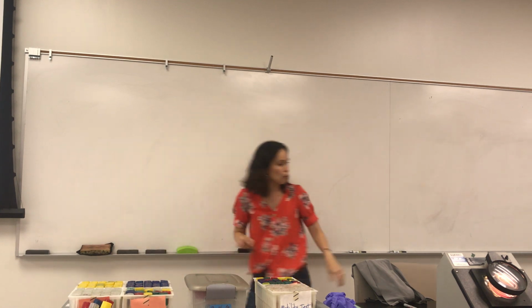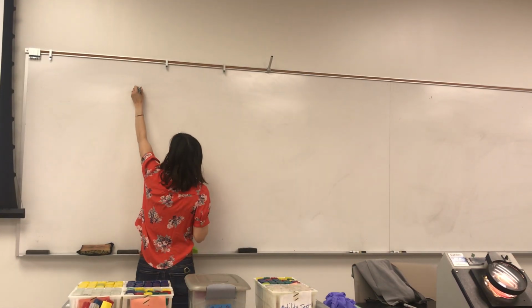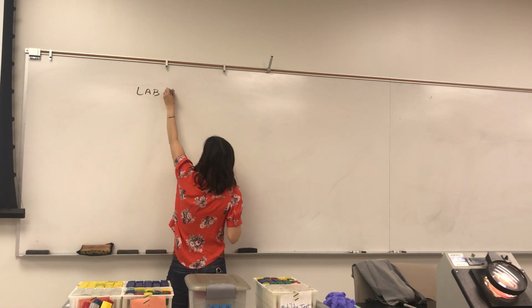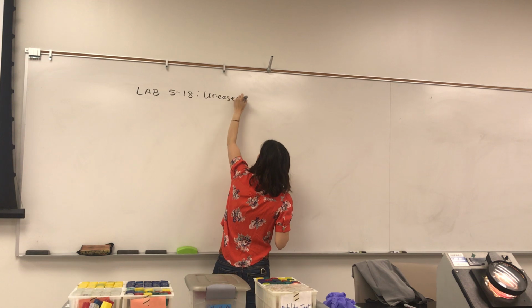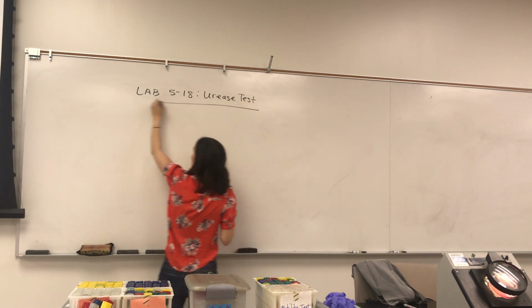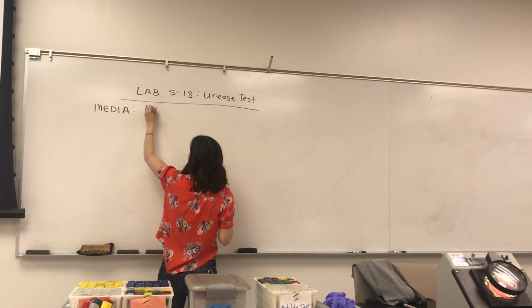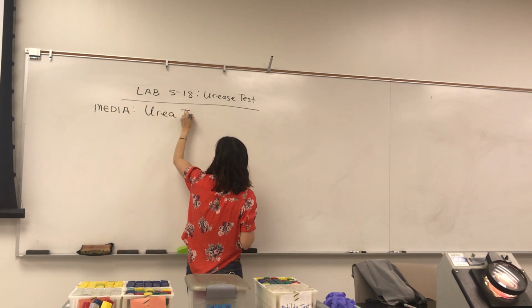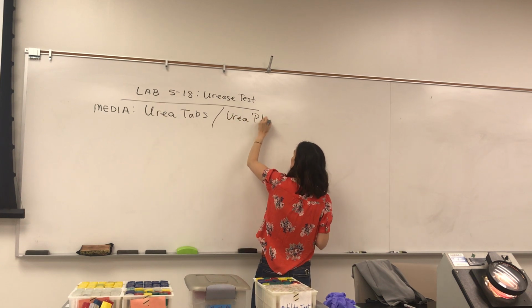All right. So for this lab, there's actually not a whole lot in the media. The only thing we're going to mention is that some of you did the tab, the urea tabs, and one of you did the urea plate.